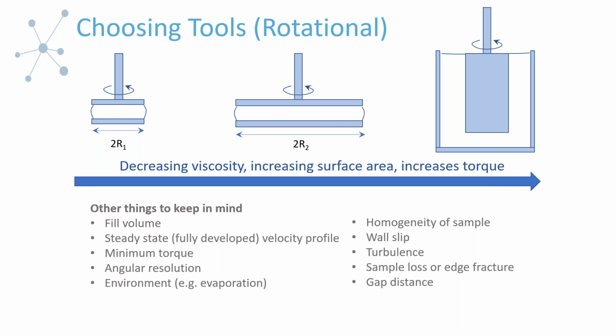So while we're thinking about this, one of the comments that I made at the beginning is that you always want to be mindful of how you're doing your experiment and think about all of the conditions that need to be met. This is very important and relevant to some of the comments that we got during the signups, and that is the idea of getting inconsistent data, not just with an individual person, but also from person to person, instrument to instrument, lab to lab, things of that sort.